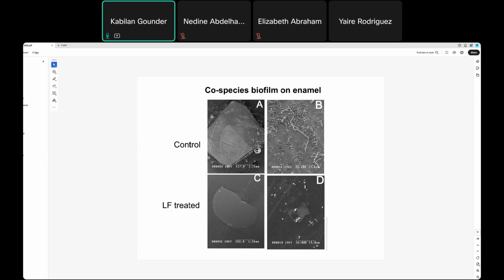Also, not only can you observe the structure of the samples, but you can also isolate the cells. Once you isolate the cells, what are you going to do with them? So we discussed all this information.